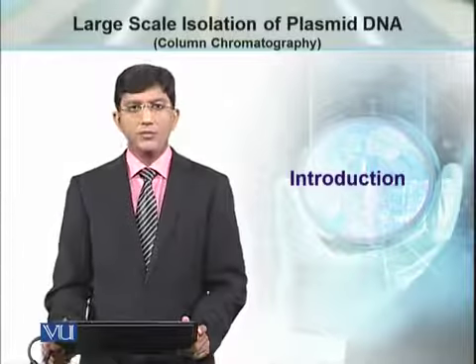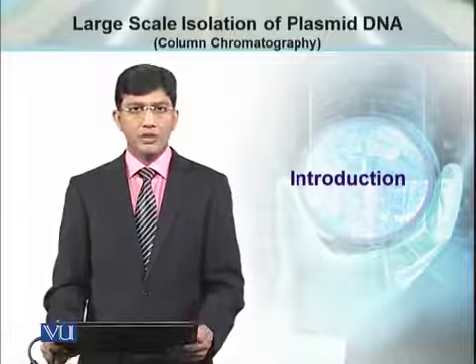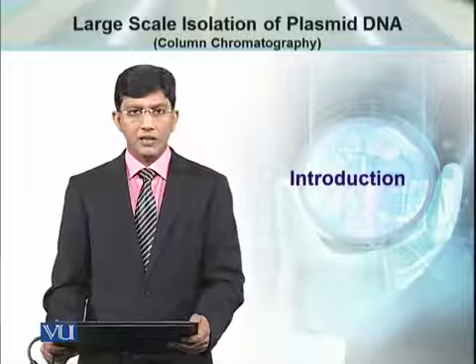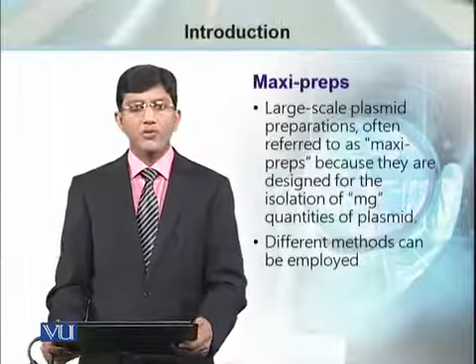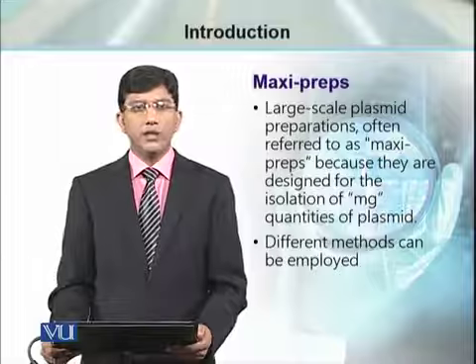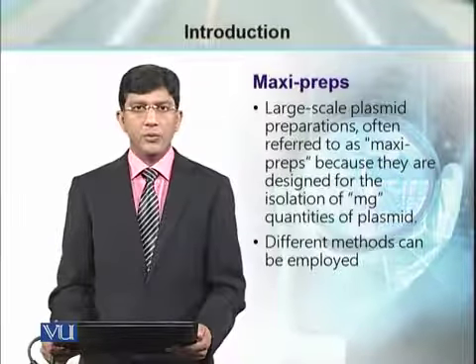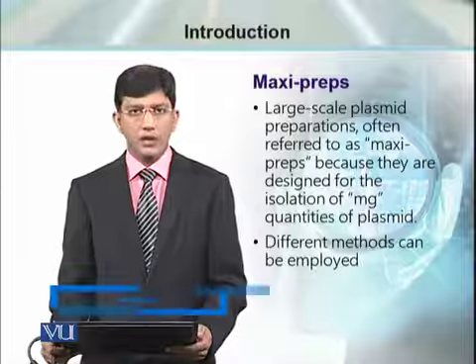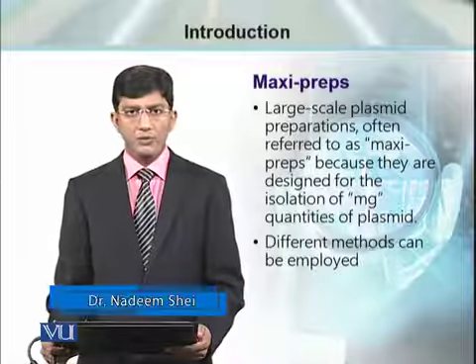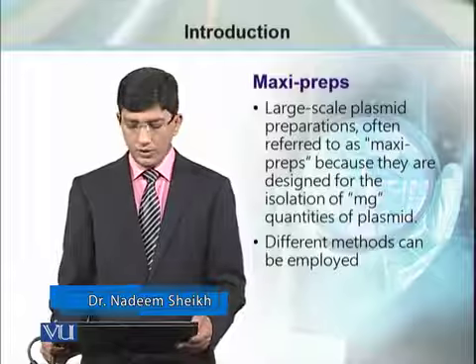अब हम बात करने जा रहे हैं लार्ज स्केल आइसोलेशन ऑफ प्लाज्मिड डीएनए, जिसको मैक्सी-प्रेप के नाम से भी जाना जाता है। इससे पहले हम मिनी प्रेप के हवाले से बात कर चुके हैं। मिनी प्रेप और मैक्सी-प्रेप में जो फ़र्क है वो एट द एंड अमाउंट ऑफ डीएनए आइसोलेटेड में है। मिनी प्रेप डील्स विद द सैंपल्स फ्रॉम वेयर वी गेट micrograms of DNA, whereas maxi-prep is a procedure by which we can isolate milligrams amount of DNA.